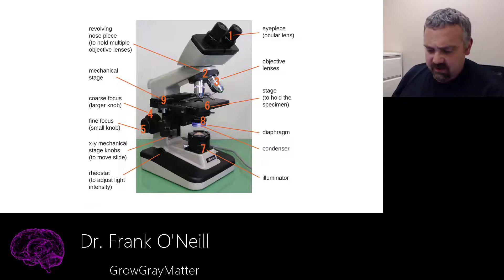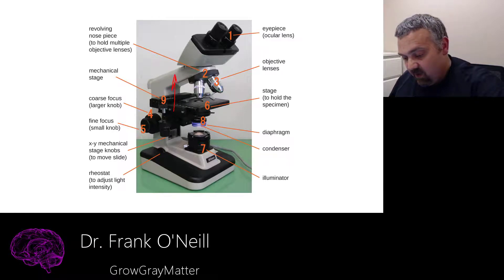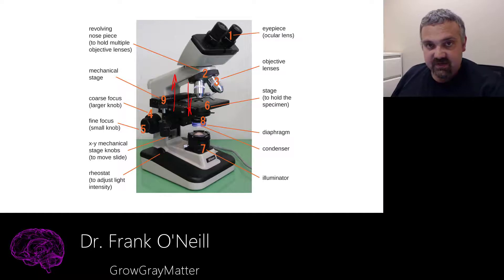So number four, the coarse focus knob. As you can see, it looks like you have one knob, but it's actually two separate knobs. Number four is the coarse adjustment knob. Number five is the fine adjustment knob. So they both do the same thing. But when you turn the coarse knob, you're going to get the stage to move up or down quite a bit.